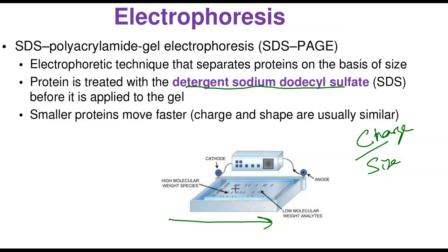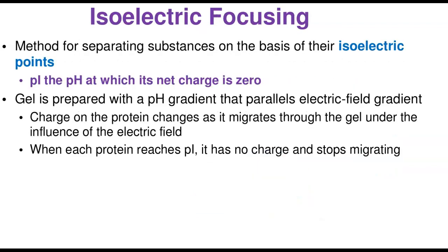So the electrophoretic technique is very good, particularly applied in separating nucleic acid. It's very, very common. Now, isoelectric focusing. Remember when we talked about this in protein? The isoelectric point is the pH of protein at which it has no charge. We will say it's the pH at which it is what? A zwitterion. So it's a method of separating based on this idea of the isoelectric point.